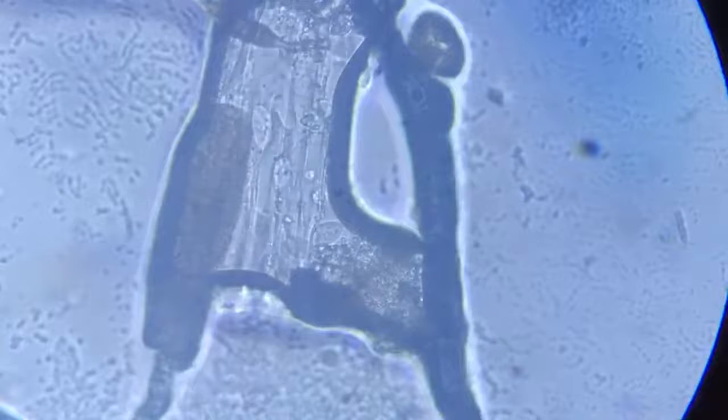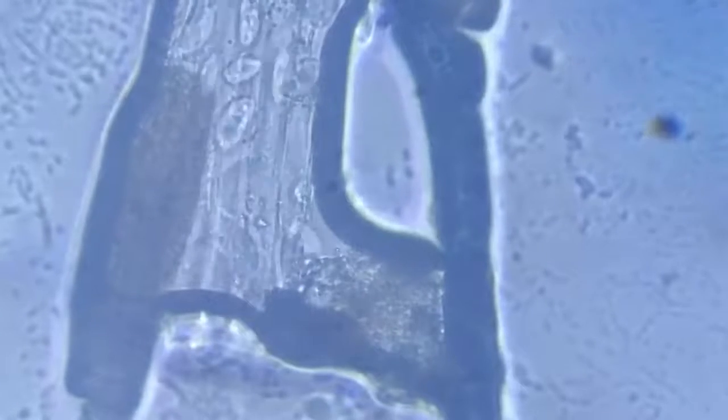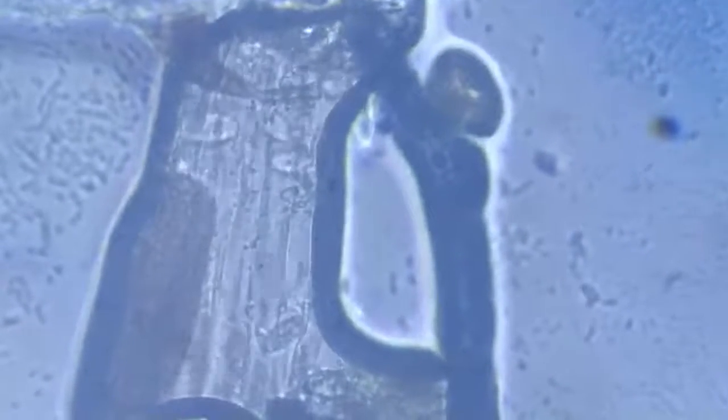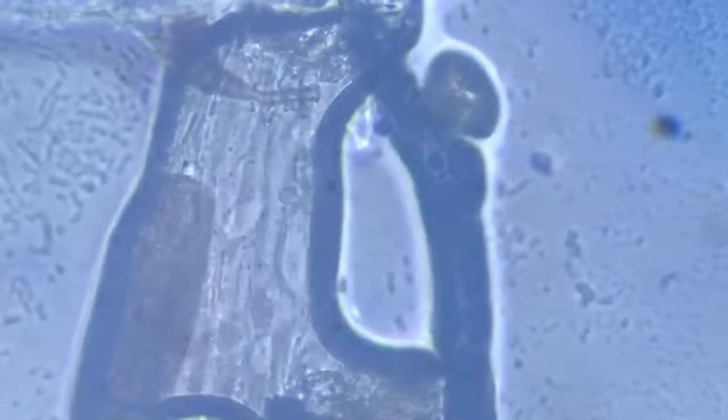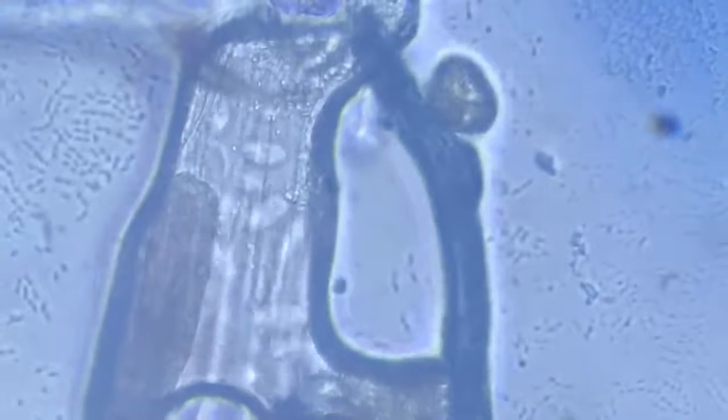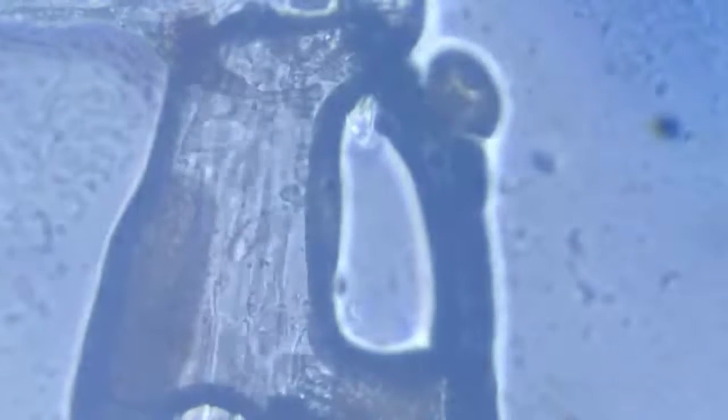Water is closing in. They have very limited space left for themselves, and you can see the struggle for space happening right there. It is becoming increasingly difficult to keep a constant focus.